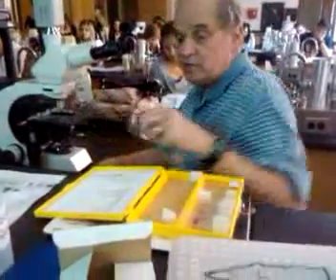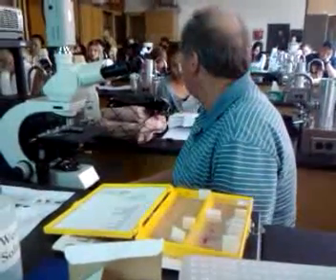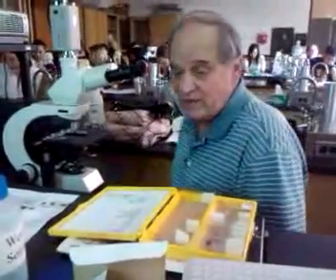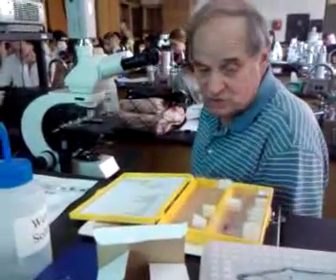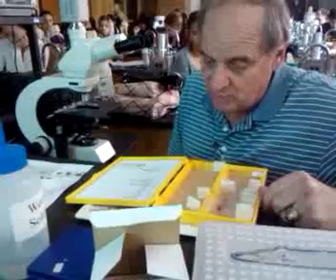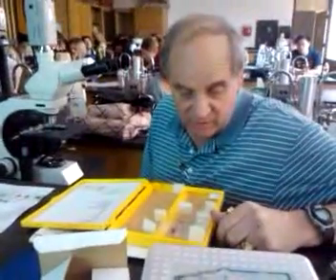One thing we need to do is look at a uterus. Let me show you a uterus real quick with the endometrial glands. We can look at the uterine slide. You don't have one in your box there. We also have to look at an inactive mammary gland. It shows lobules. There might be one of those right here, and I do want to show you the uterus. So you can see the endometrium and myometrium. We'll have one of those. It'll be on display over there.